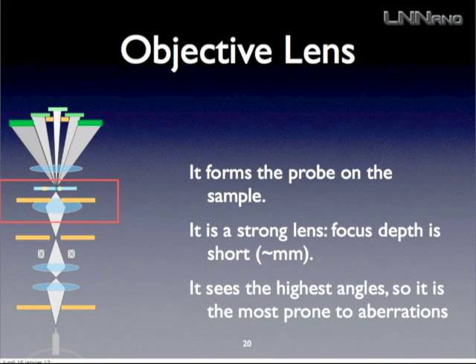But still, a small change in the design or a small scratch in the inner part of the objective lens can really kill all your resolution, your spatial resolution. Okay. So this is for this objective lens.